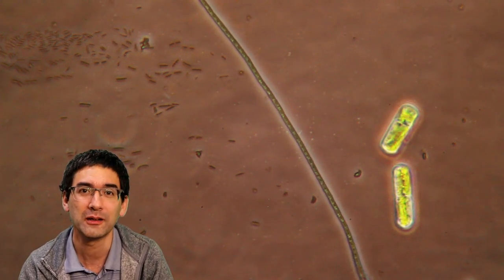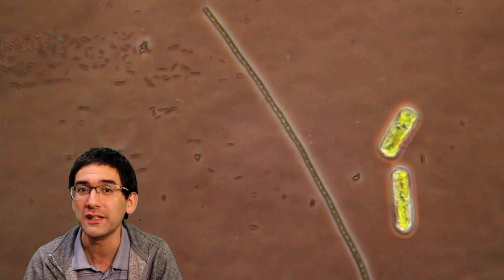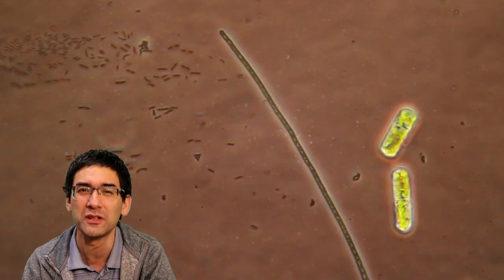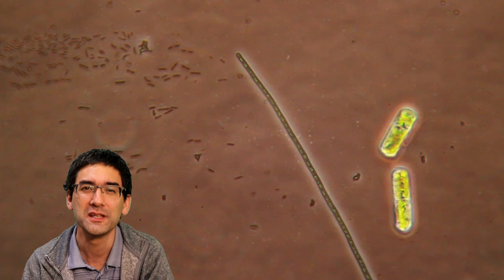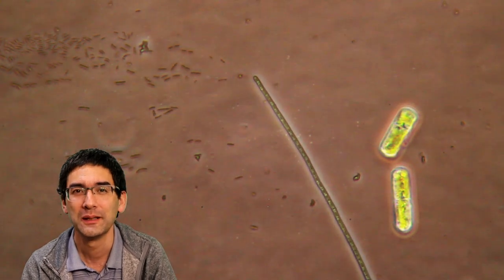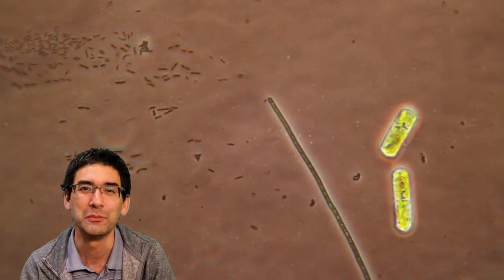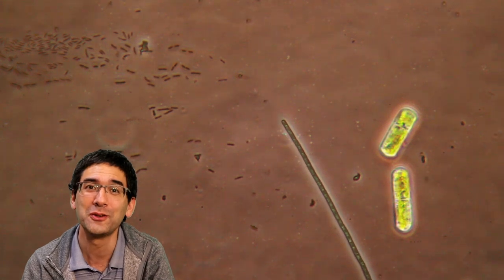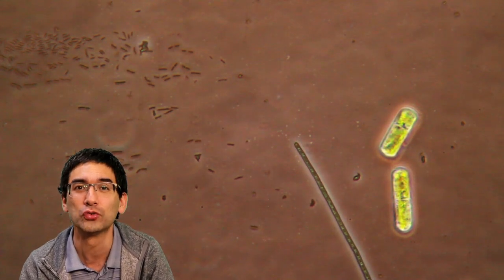It also looks like a eukaryote in any case, because I do see some very small cell organelles in there. This is a little bit of time lapse, but I'm not quite sure what it could be. In any case, I just wanted to show you that there are quite a lot of interesting things that you're growing here.